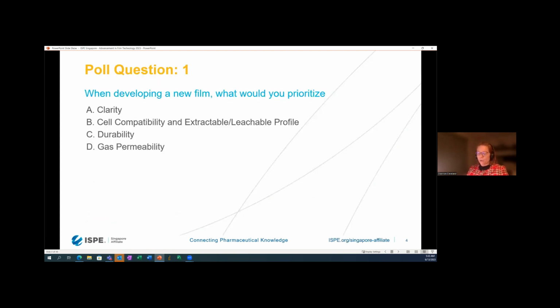And here we have our first poll question. What, if you were to develop a new film, would it be that you would prioritize? Would it be clarity, cell compatibility, and extractable leachable profiles, durability, or would it be gas permeability? There is a poll slide here that if you see it on your screen, you might have to drag it over to be able to respond. So I'll give you a little time to put your input in as what you think would be the priority in developing a new film.